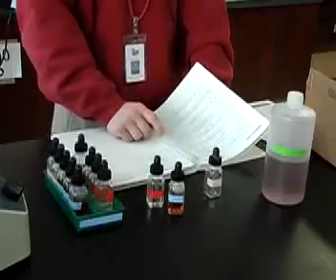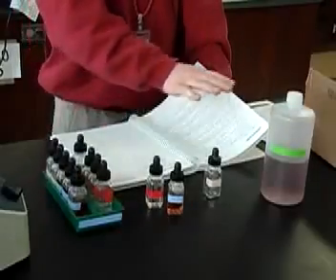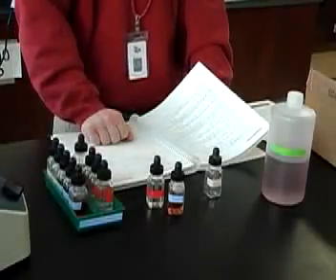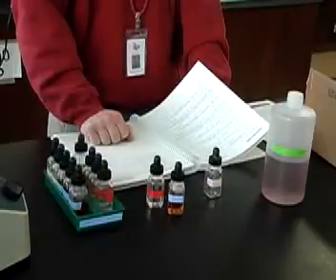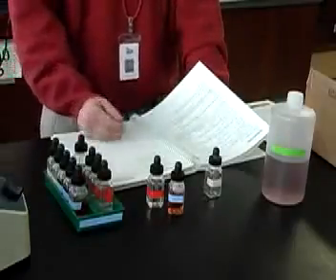Well, it says that it's a colorless solution, and that's a clue. And I'll have all 10 solutions out here for you to see before you start. And it turns out that cobalt, manganese, and iron actually have some color to them. And you should memorize those colors like we've done in the past.